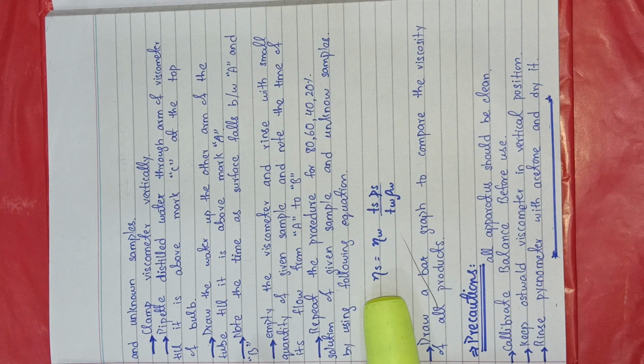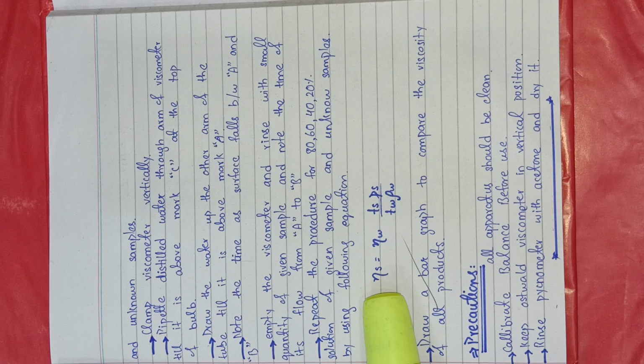Now you draw the water up to the other arm of the tube and above the mark A. So first you fill it above the mark C. Now you fill it above the mark A. These markings are given on the viscometer, and I will show a diagram to you also.